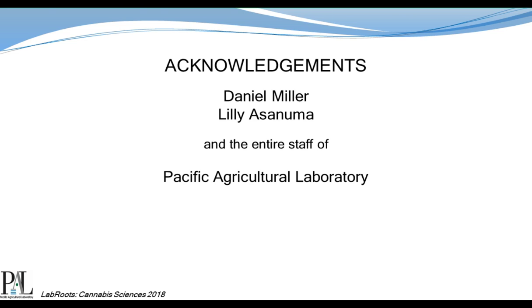Time of flight and other accurate mass instruments definitely are going to play a role in screening pesticides, both in conventional agriculture and in cannabis and hemp. The FDA has been evaluating this technique for import commodity testing, where they have very large target lists, and a number of individual states use the accurate mass approach for their initial screening technique. I think that for cannabis, some additional sensitivity is going to be needed, and a better understanding of the matrix effects that a time of flight or accurate mass system may give you. It'll change the way the workflow is done, but it could be a big advantage.